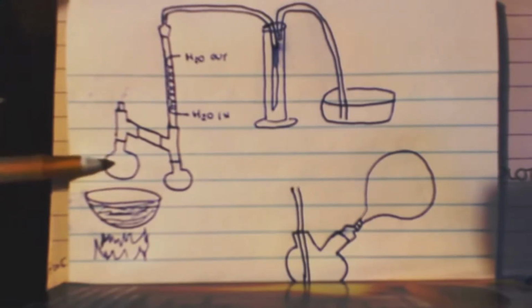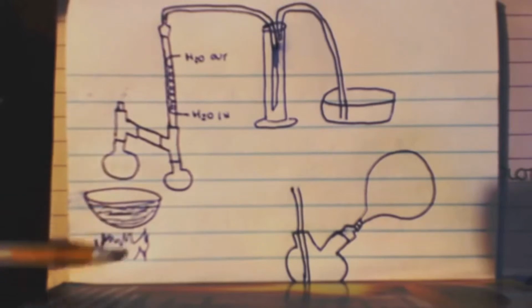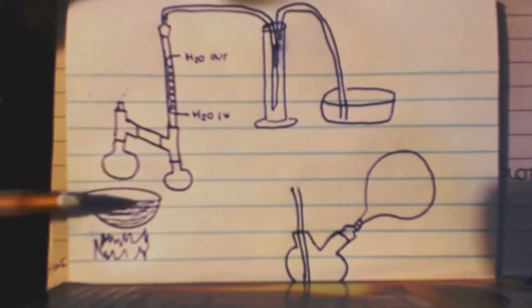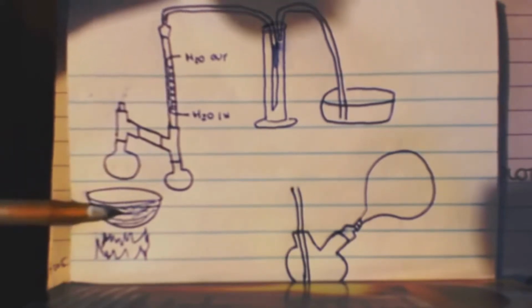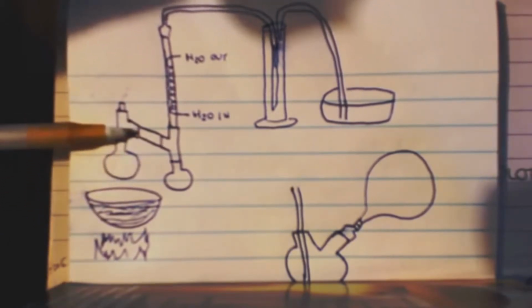This would have my sodium bicarbonate in it, and I would raise and lower this and put the heat on until I got it fixed at a nice slow rate of bubbling, right? Now what will happen is you will make your carbon dioxide and you will make your water. If you have this hotter than, use an oil bath, you can distill off the water so it won't interfere.